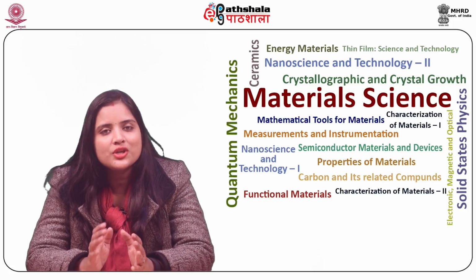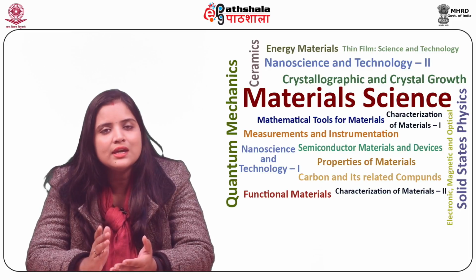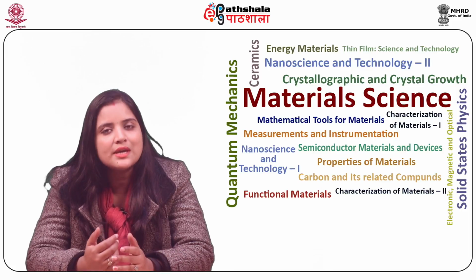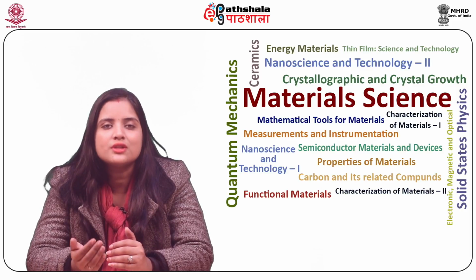Eventually, images are generated by recording the secondary electrons, that is SE, and the backscattered electrons, which are BSE, emitted from the target and captured by the electron detector.